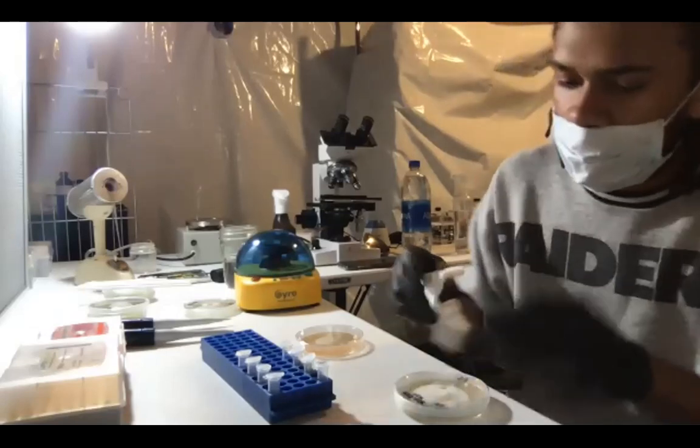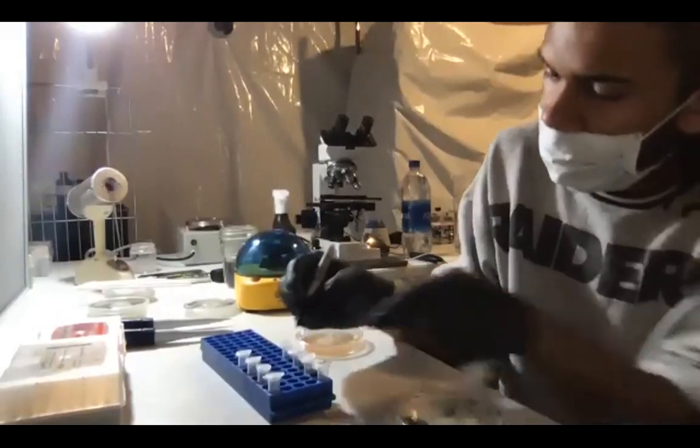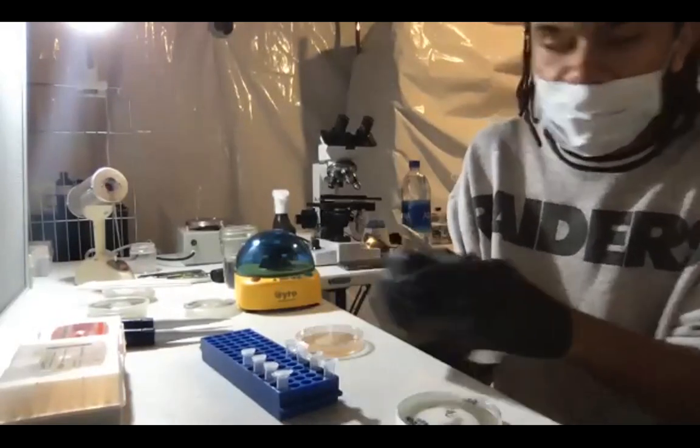So now that I did that one, I'm going to clean this off, and I'm going to write number two on here. This is the second one. I'm going to put number two on here so I can keep track of everything.